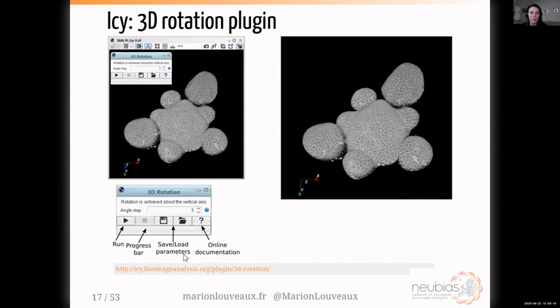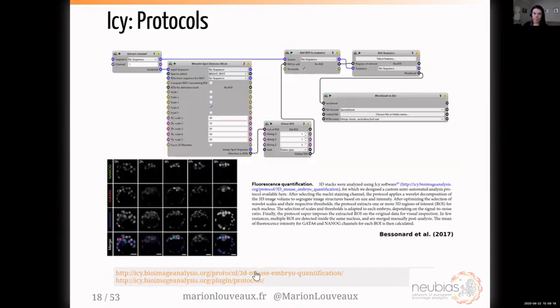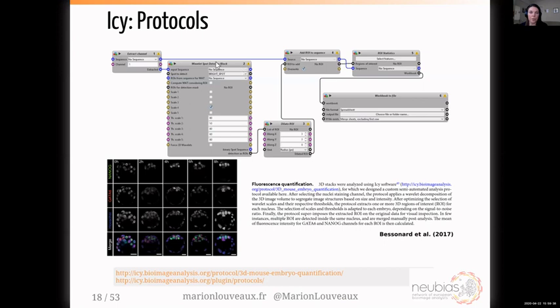Besides plugins, you can write protocols — combinations of blocks. I'll show more details in the second part on how to make a protocol. Some of these blocks correspond to plugins; for instance, this one corresponds to the spot detector plugin. Other blocks are for intermediate steps like extracting a channel, modifying ROIs, or computing features. This particular protocol has been published in 2017 and is on our website, so you can download and reuse it.